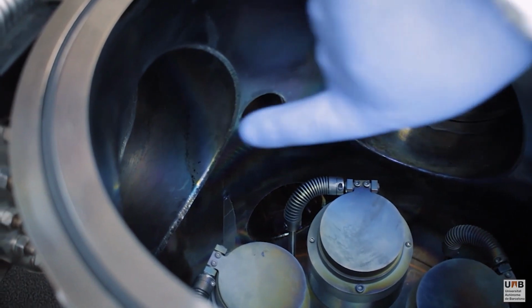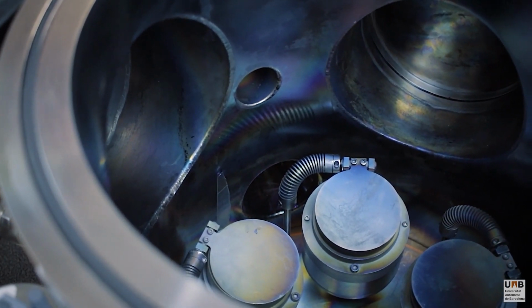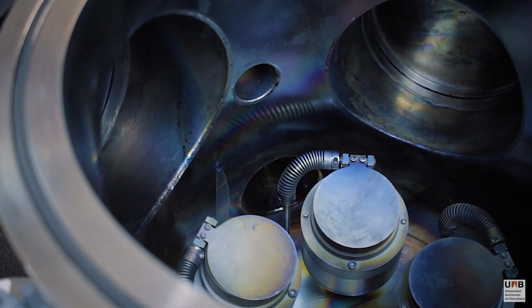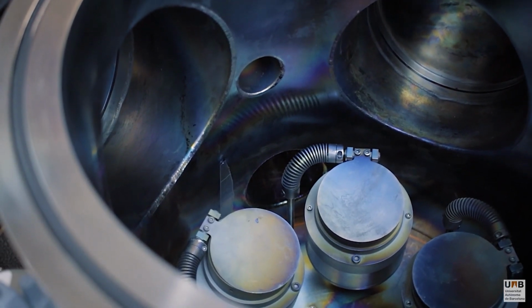On this side, we have the turbo pump. And the key players in the sputtering process, the 3 guns that you use to sputter, with their gun, chimney, and shutter. I'm going to open up the shutters to show you the targets inside.